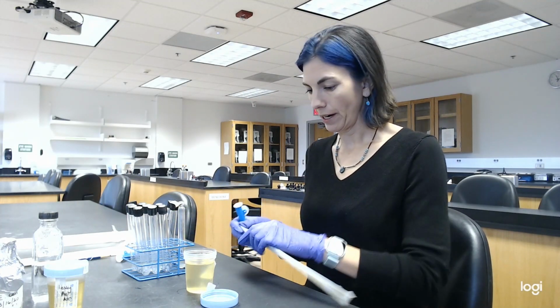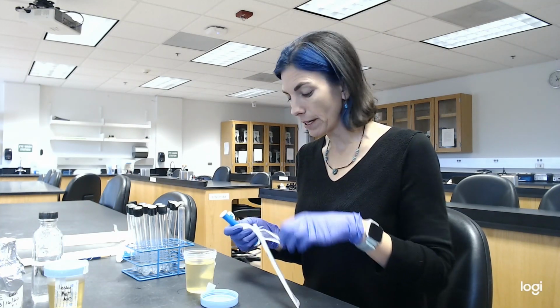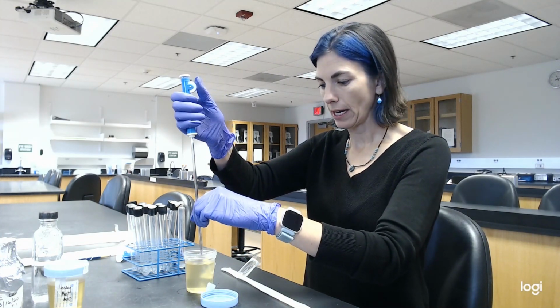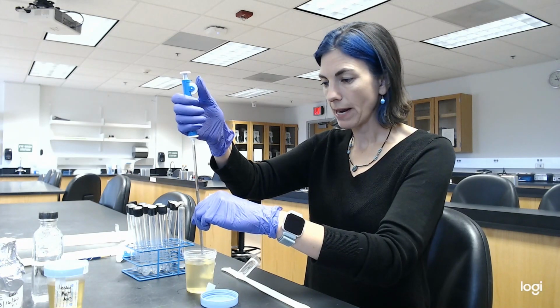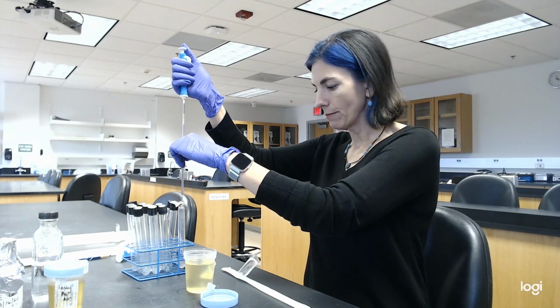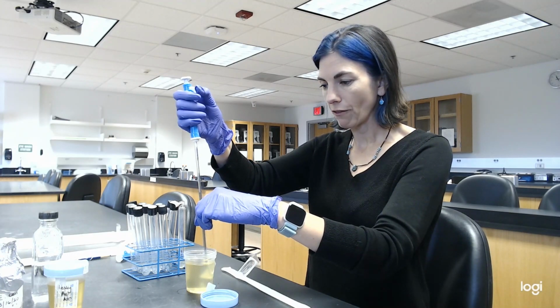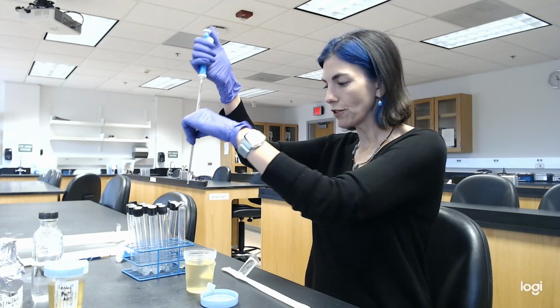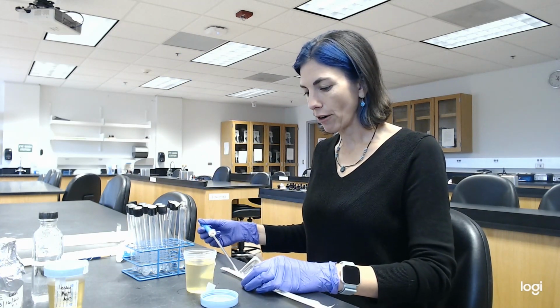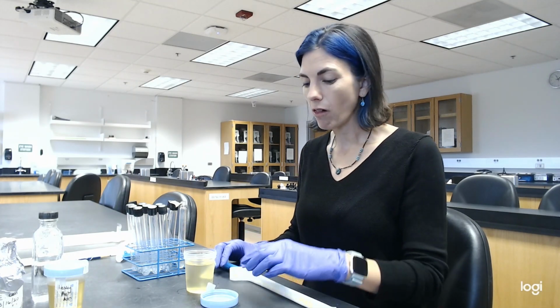And finally, the urine after Azo tabs. Now, ideally, I would have taken a first morning urine sample in both cases, but because the faculty were given very short notice that we had to be off campus sooner rather than later, I was not able to give myself enough time to collect first morning samples prior and after. So I collected my urine yesterday afternoon, and then I collected my urine again, not my first morning urine after the Azo tabs, but around 11 o'clock.